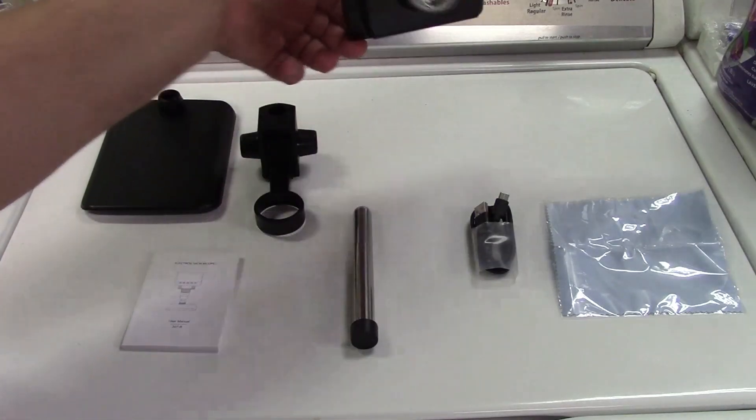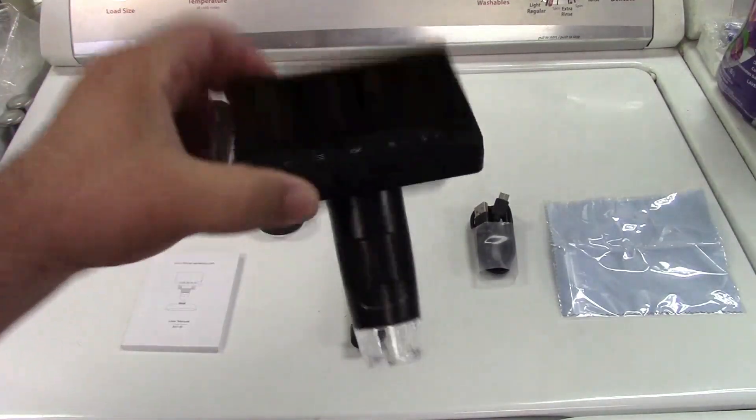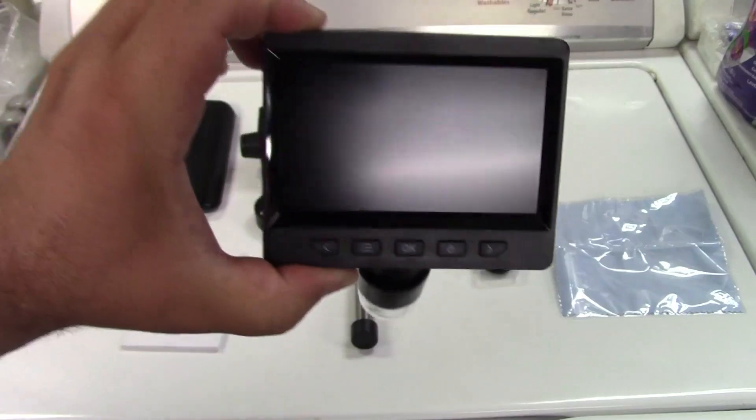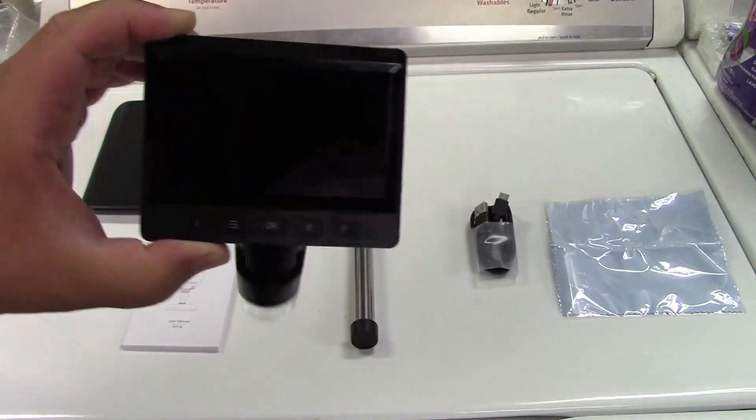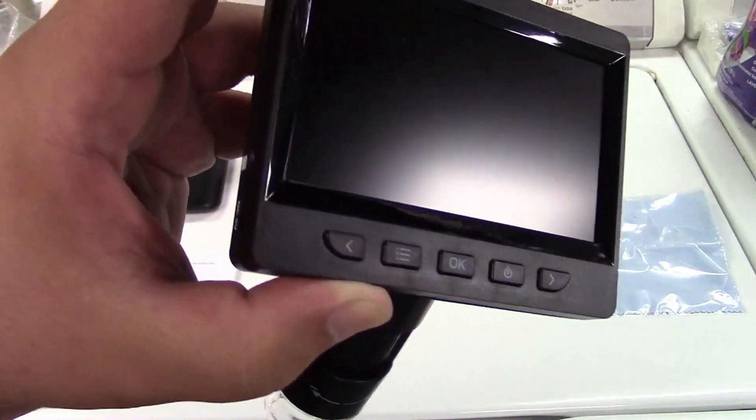Here is the scope itself, that's the part it sees out of, that's the part you see in. Very simple like that, just a little box, real easy to control, five buttons on there.